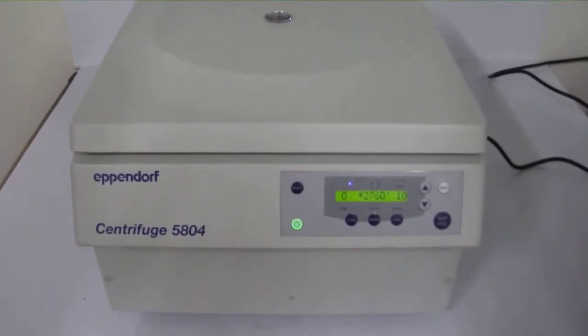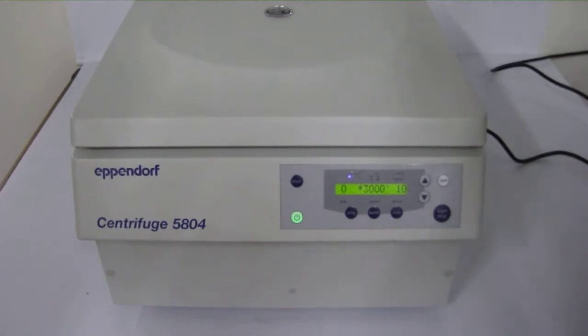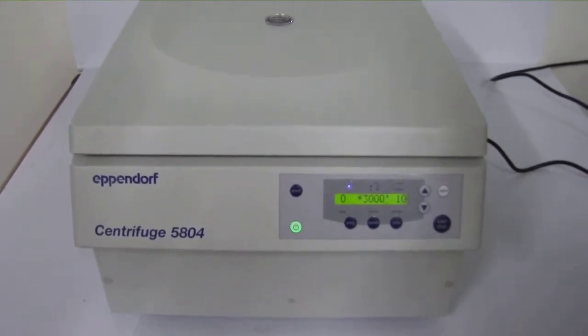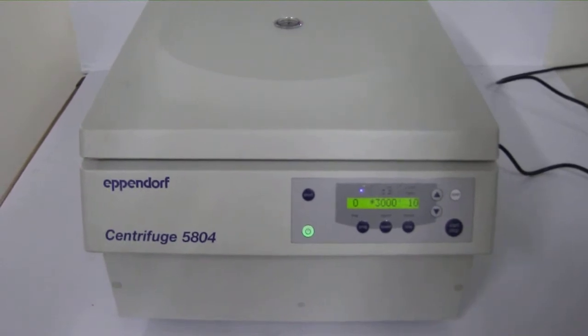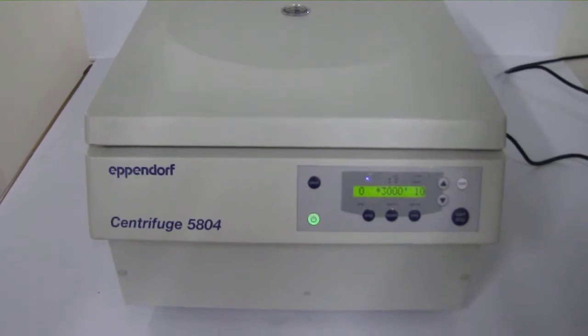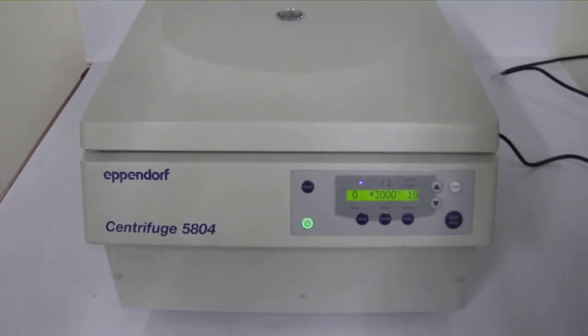Our Eppendorf 5804 centrifuge is in virtually new condition. The Eppendorf 5804 is designed to operate at low noise levels for a quiet work environment, with soft-touch lid closures for a user-friendly feel, and a low profile for easy loading and unloading of samples.